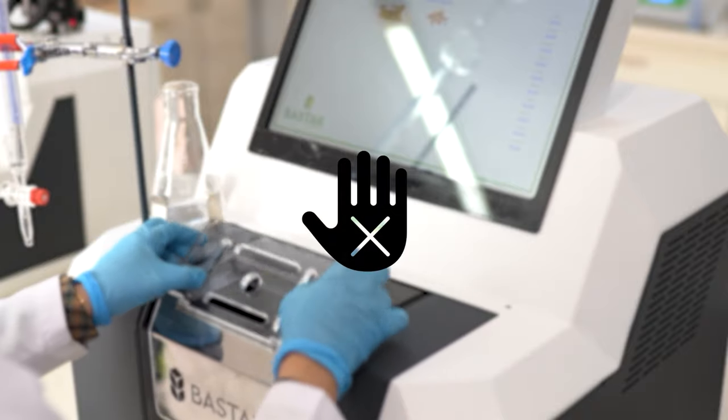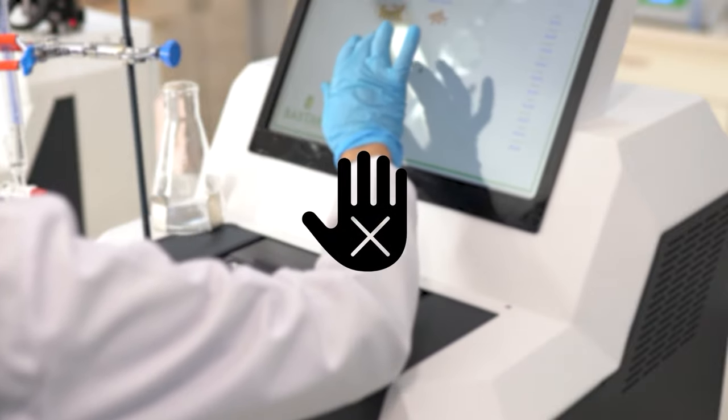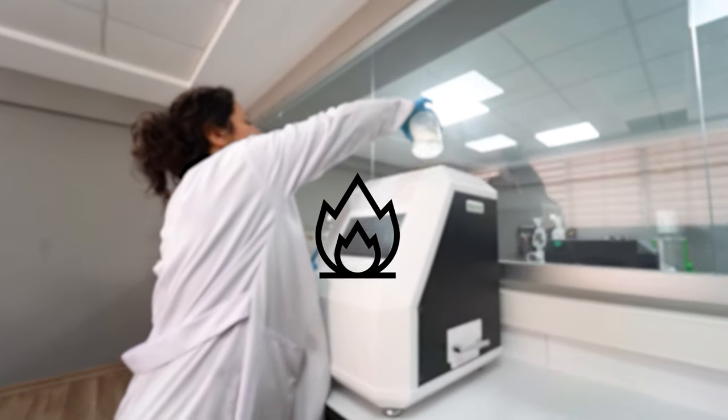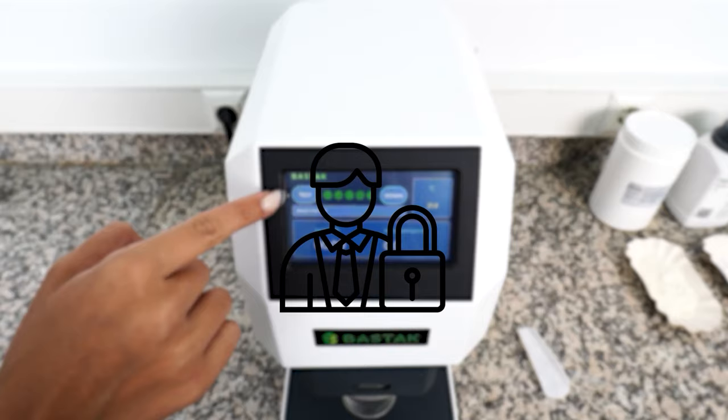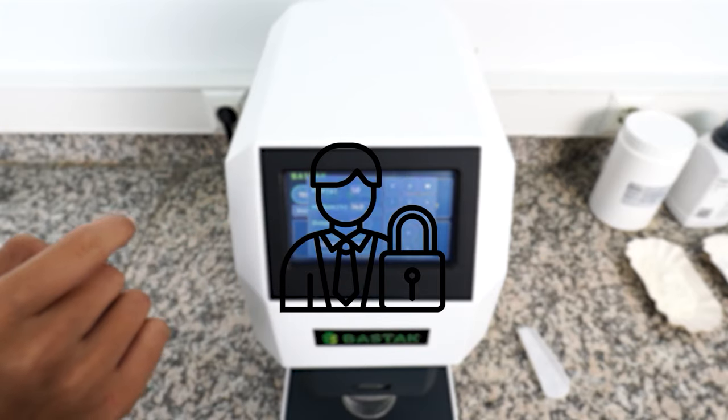The device should not be used by persons other than the operator who knows how to use it. There should be no flammable or combustible materials on or near the device. Unauthorized persons should not be allowed to interfere with the device. In case of any problem, the BATAC technical service team should be contacted.